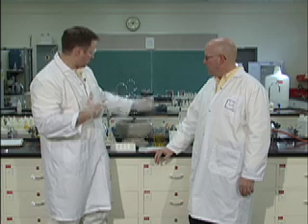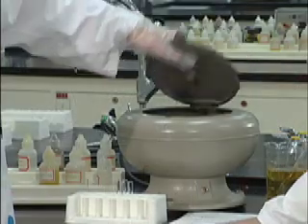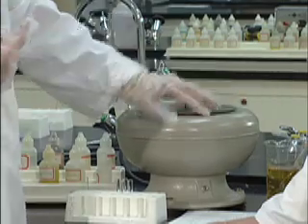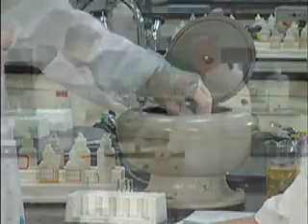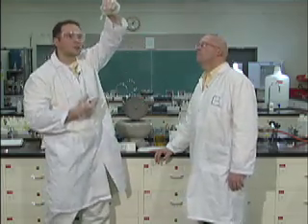Okay. Now, with the centrifuge, it has a brake on the top. Some of the brakes are really good, some of them are really bad. If you have to put force on the centrifuge, this thing gets going up to about 6,000 RPM, so it's very quick. So please do not open it while it's going. You might lose a finger. Okay? Oh, it is going fast. It is still going, yeah. So again, close it back up, put the brake on. Eventually you'll hear a click, it stopped. And our solid has now collected on the bottom of our tube.